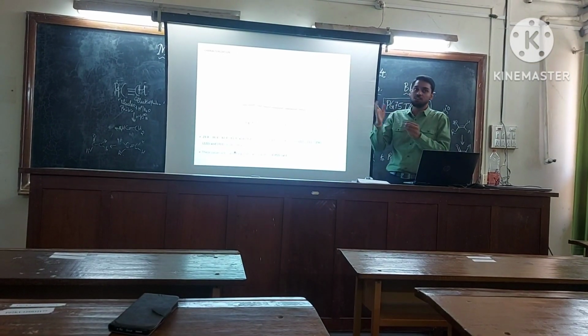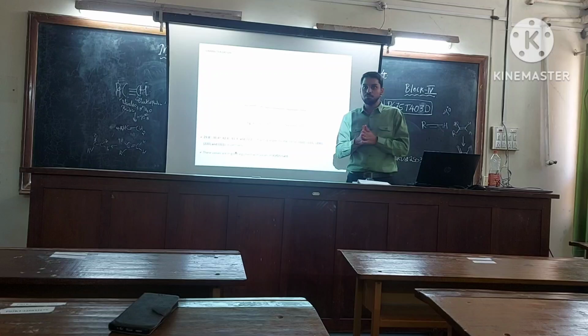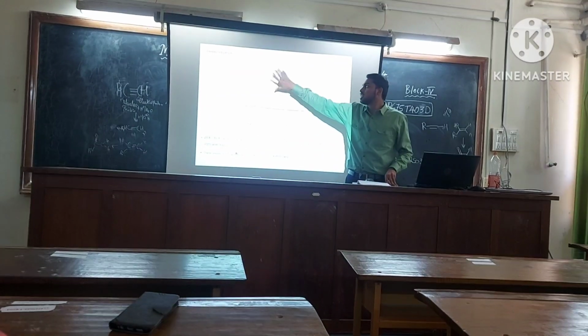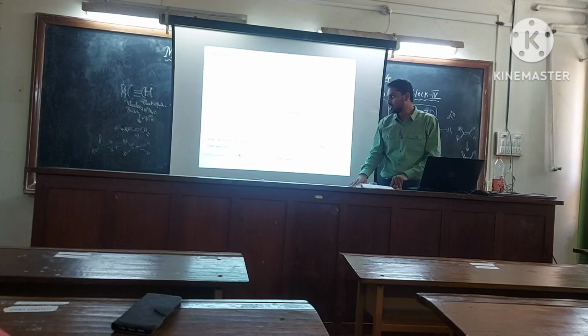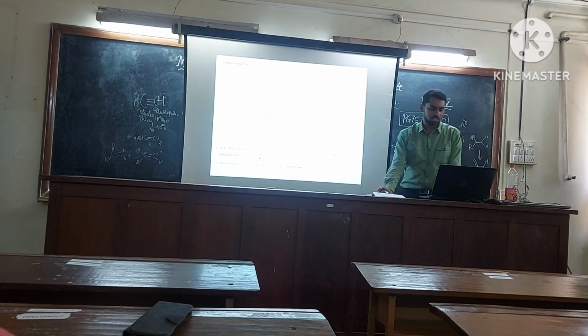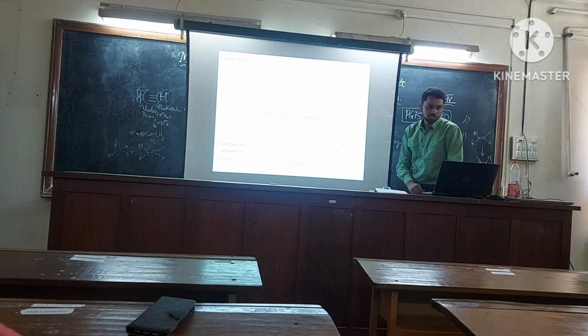We verified these with the powder XRD library values, and we came to know that we have obtained the copper +1 oxide. These were in good agreement with the JCPDS cards.